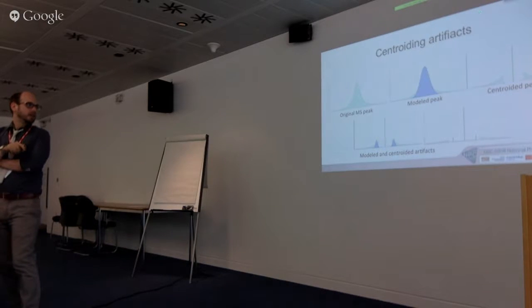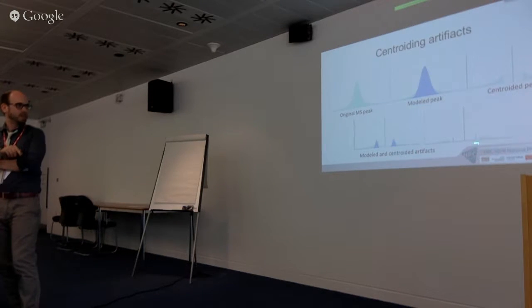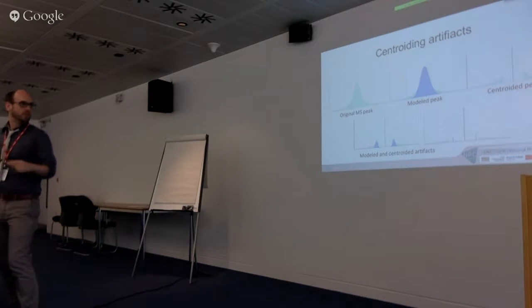Unfortunately, it's an inherent attribute of a TOF that resolution is dependent on the intensity of the peak you're looking at. And so most peaks we find down at the tails, the top and bottom of them, are significantly broader. And this means the centroiding algorithms tend to fall over, and we end up with these funny little split peaks, little fragmented centroids at either end of what should be a large unified peak. And that brings in further noise in the peak picking.